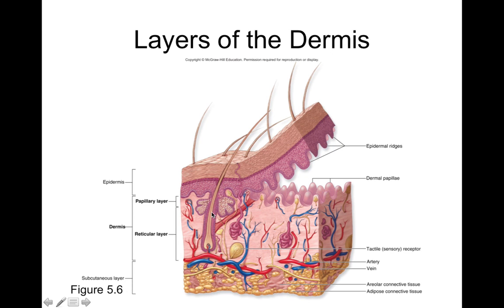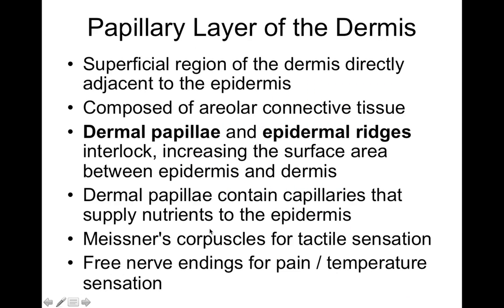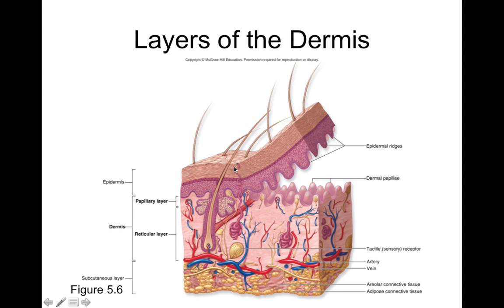Now, you also find some epidermal appendages, or dermal appendages, like hair nearby. If you look at the structure of hair, all of that surrounding it is called the follicle. But if you follow it up, you see that the follicle just looks like an extension of epidermis going deep, and it is. So the hair follicle is made of a stratified squamous epithelium. It's keratinized, and when it divides, those keratinized cells get pushed into the central region, which helps form the hair. Then this grows upward and outward, and that's what hair is. It's basically just a big chunk of keratinized cells. But you don't find any nucleus or organelles in hair. So if you had a clipping of hair, there wouldn't be a lot of DNA on that clipping, right?